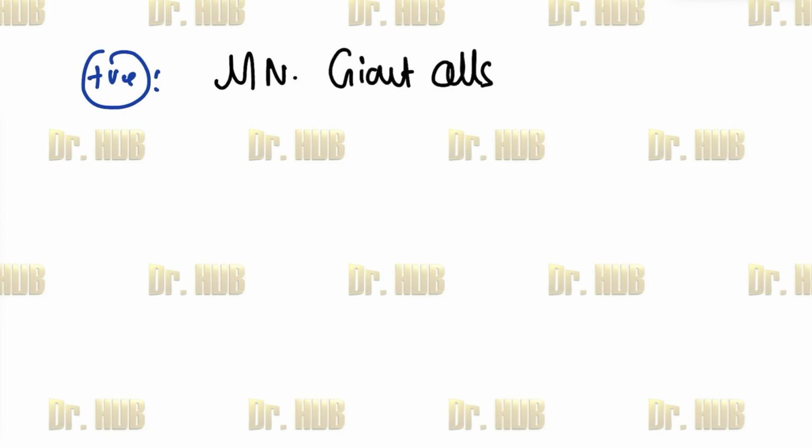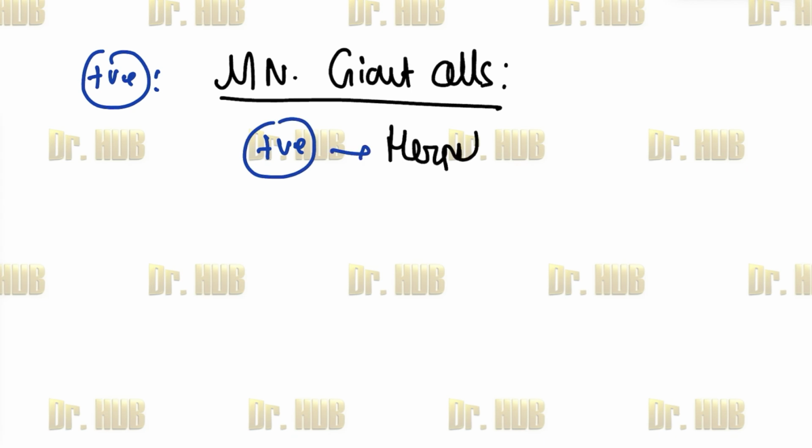In case it is positive, what are the findings? We look for multinucleated giant cells. If they are positive, it stands for the herpetic infections.